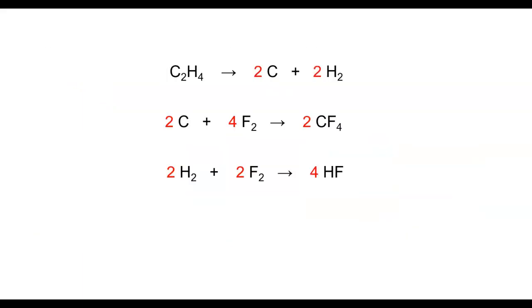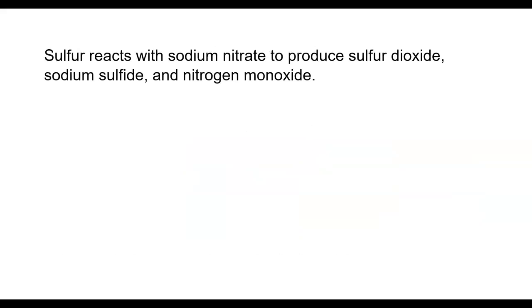So I've got to get all the way back to the beginning. Okay. So what we're going to do is we're going to put some sulfur and some sodium nitrate into a little container that gets suspended inside of a soda bottle with a little bit of water in the bottom. We're going to use the blowtorch to light the sulfur and the sodium nitrate on fire, and then we're going to put that into the bottle with the water and watch it burn.